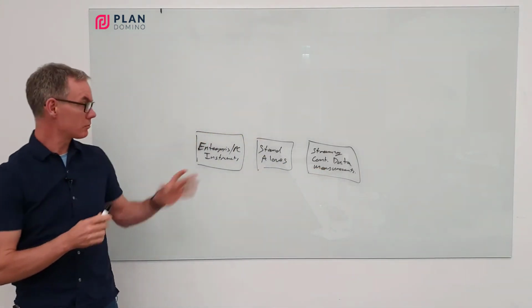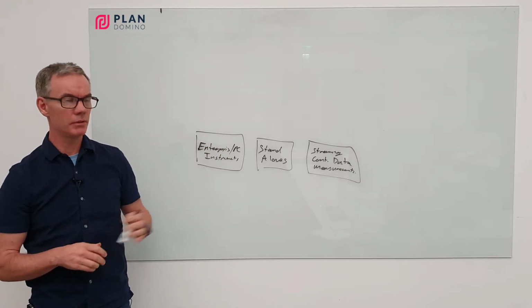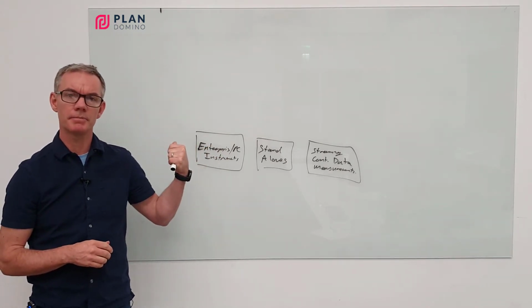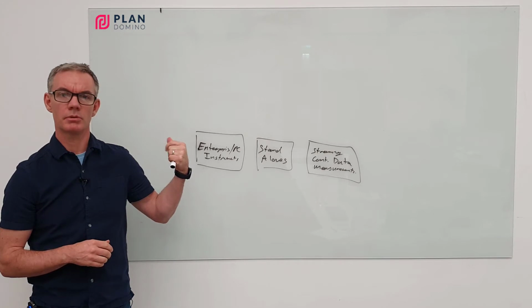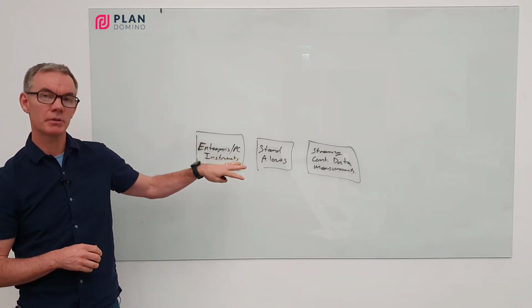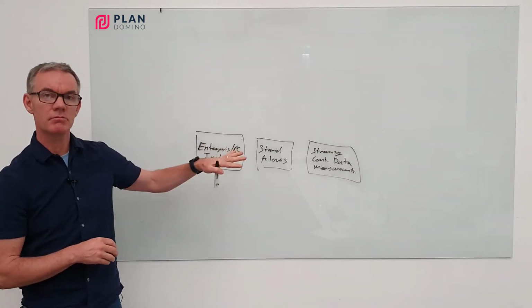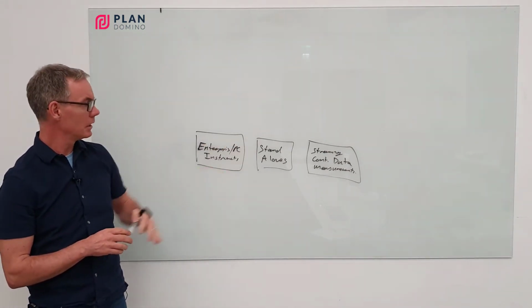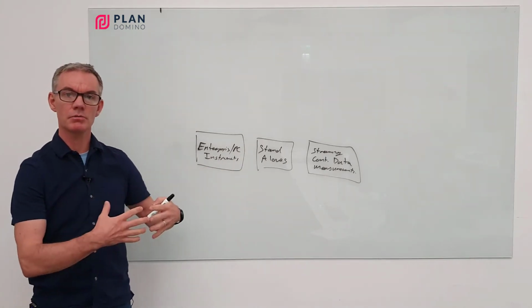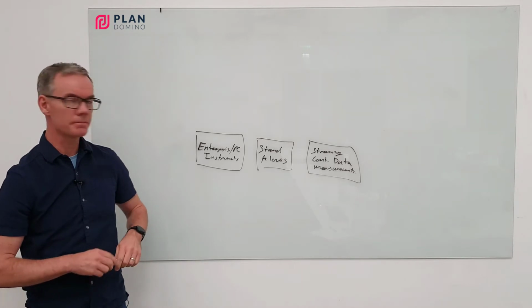So for the most part, this represents our hardware, our instruments. If we were to make an analogy with the previous board, this is our PLCs, I suppose, and our actuators and our sensors. They sit right down at the bottom here. These are physical pieces of equipment on the ground.